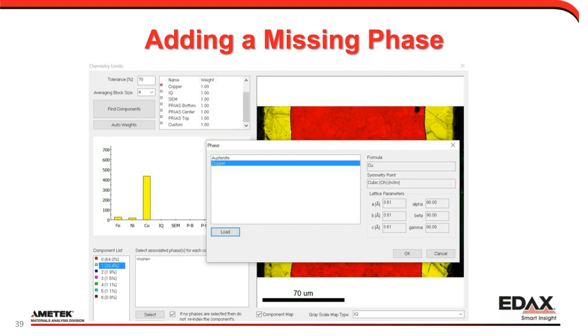Usually quantitative EDS data is a little bit tricky to pull out of EBSD maps. The reason is because let's think about signal generation. If I'm doing an EBSD map, I can go up to 1500 frames a second. If I'm collecting at that frame rate, at 100,000 counts, the total amount of counts I'm getting per pixel will be relatively small. So I'm not going to have really good quantitative data on a single data point. But I can start grouping things together and then do that.